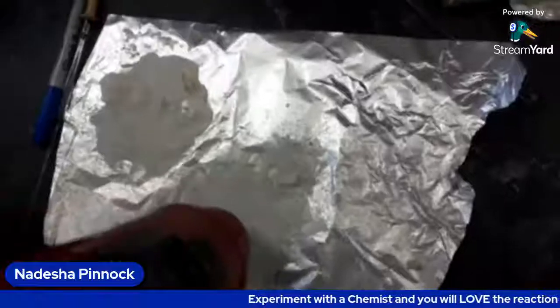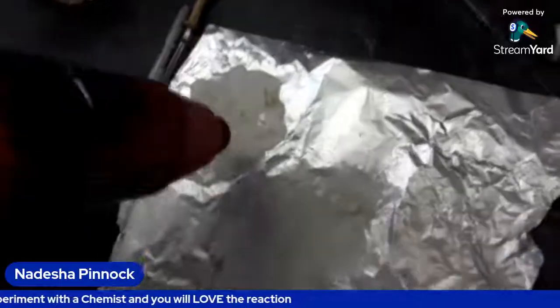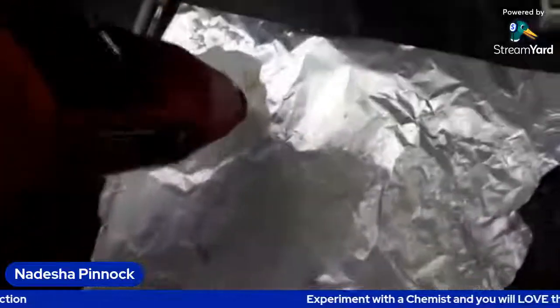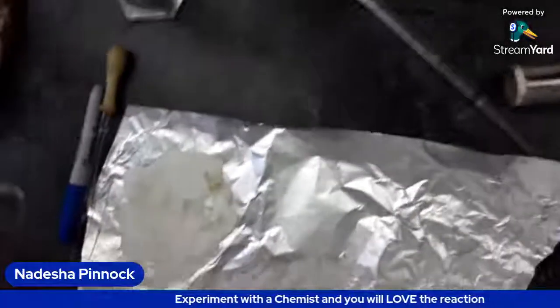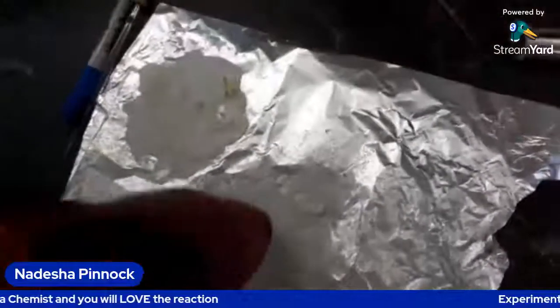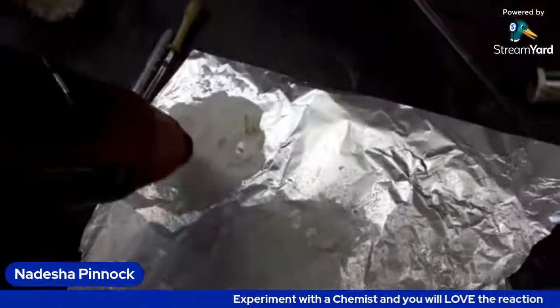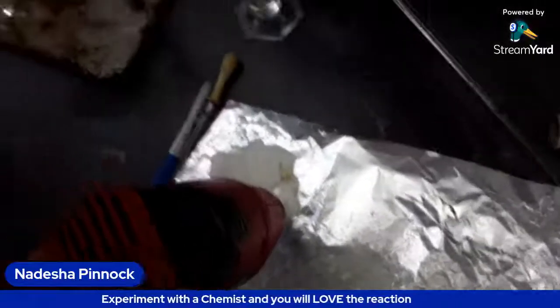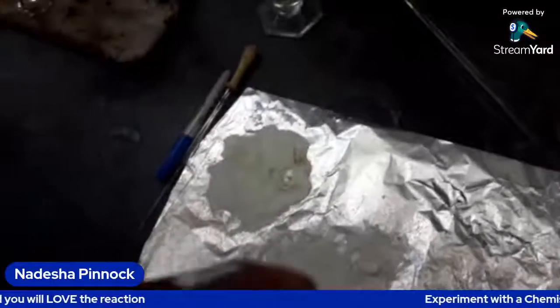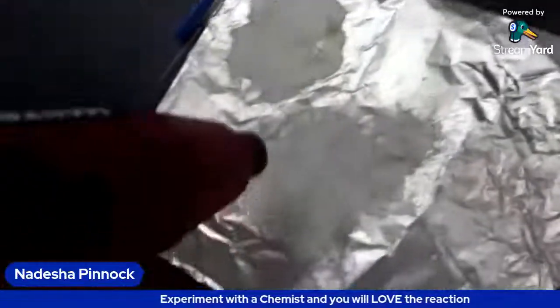As I had mentioned before, the drying process is the longest part of it. Mixing the materials together, heating, getting the thick bioplastic, that's the easy part. The longer part of it is the drying. Remember, you have options. I don't know if you want to use your hair dryer at home to do this, but you can easily use a microwave, or you can just leave it to air dry, which will take a while if you do that.